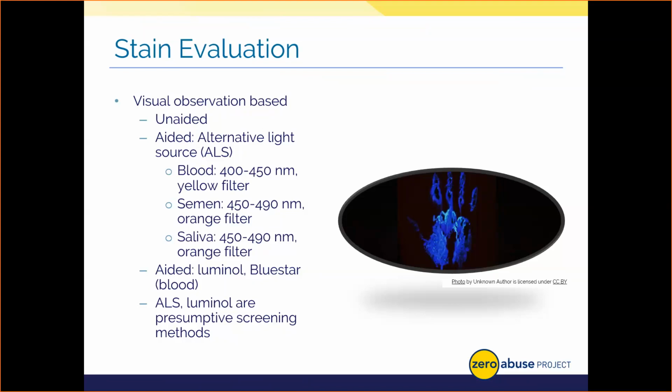Believe it or not, these aids, such as luminol, don't impact DNA testing, so they can be used on samples to detect potential blood. Please be aware that blood-based fluorescent chemicals are indeed presumptive measures, as there's a bevy of false reactions that can manifest and give off the presence of blood when in fact it's not really there. Things such as, believe it or not, cigarette smoke or ice melt for your sidewalks as we embrace winter and beyond can actually give a false result with these chemicals.